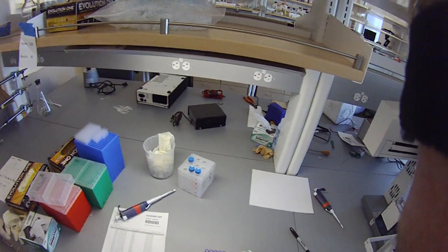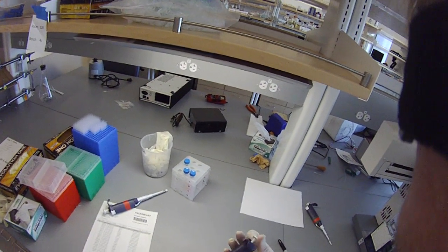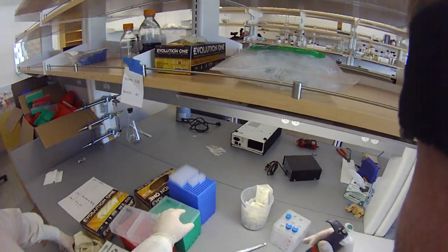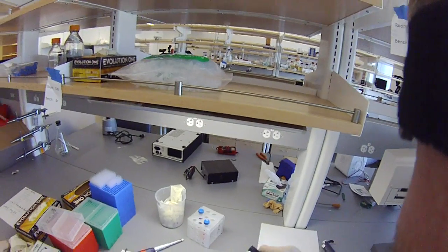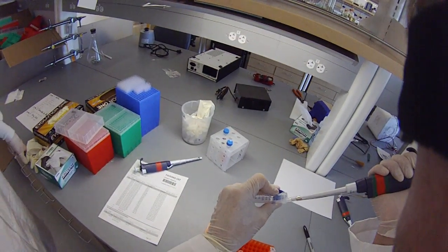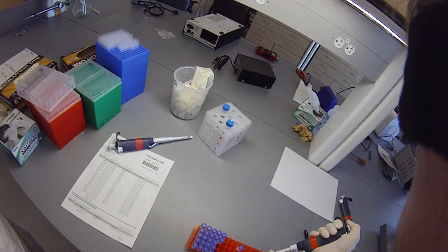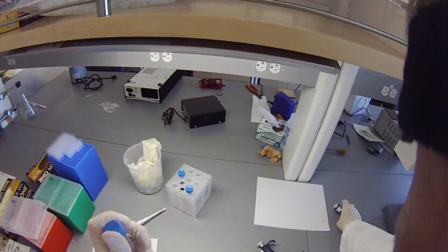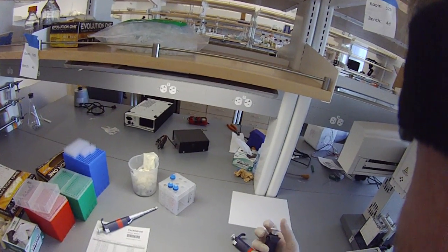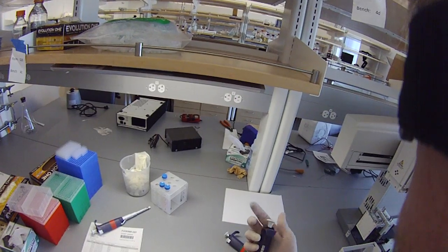I'm going to take my pipette and set it at 90, and I'll do 90 microliters of good water. And then 10 microliters of 100 micromolar oligo.